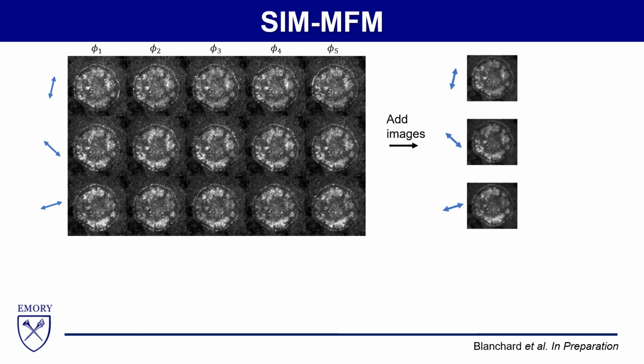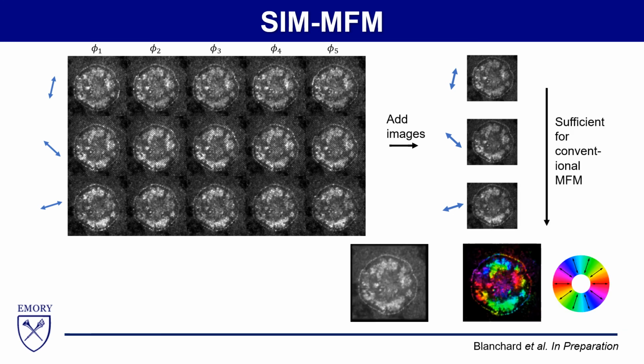If you run a simple mathematical reconstruction to obtain the pixel-by-pixel best fit sinusoid, and then display the XY plane angle of the force in each pixel, you can see that the platelet is contracting radially inwards as we saw before. I want to note that I've switched to the color-based method for displaying force in plane orientation. If you reference this color wheel, you can see that the left and right sides of the platelets are red, meaning that they're pulling side to side, while the bottom and top regions of the platelet are green, meaning that they're pulling up and down.